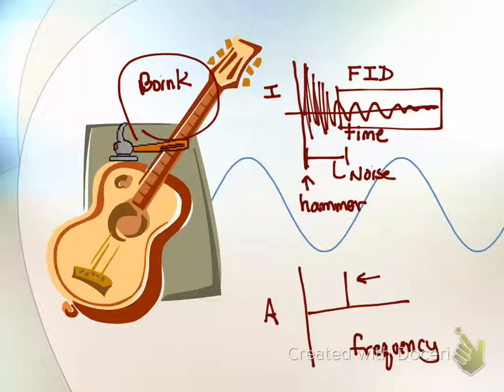Well, you guys know what a Laplace transform is? Anybody know what that is? Or a Fourier transform? You kind of hit it in math, at the end of differential equations. It's a way of mathematically converting time-based data into frequency-based data. It's like a very fancy log button. If you had a button for Fourier transform on your calculator, you could take a series of data points and press Fourier transform, boom, and it'll kick out the frequency components. Okay.